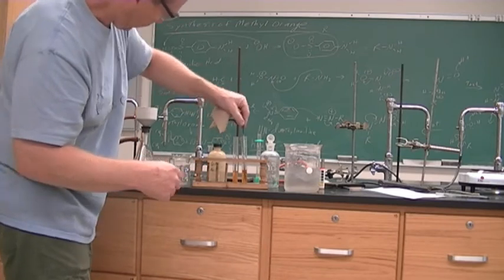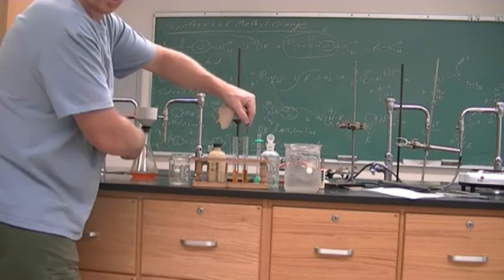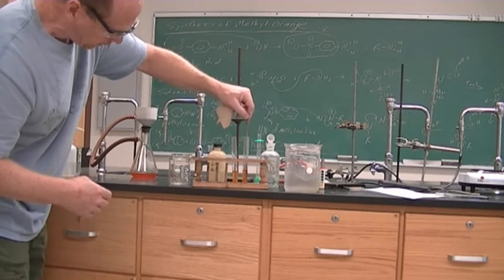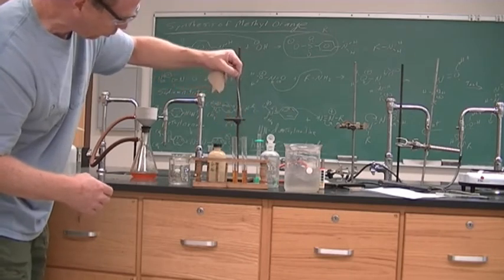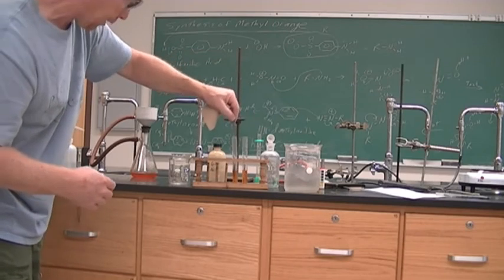All right, so there's definitely some methyl orange that has filtered through because methyl orange is soluble in water, as we can see here. The water turns this orange color.